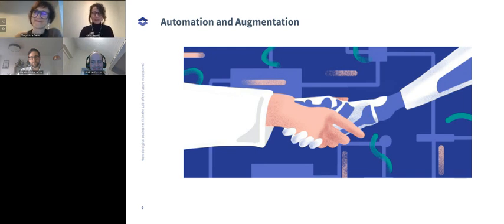It's maybe not anymore manual technicians, but rather technicians towards robot systems, or the knowledge as data scientists or as engineers would also be more present in the lab to interact with the systems. Yeah, basically, you're absolutely right. What ends up happening is that the human being moves up the value chain, and automation takes over the more repetitive tasks.